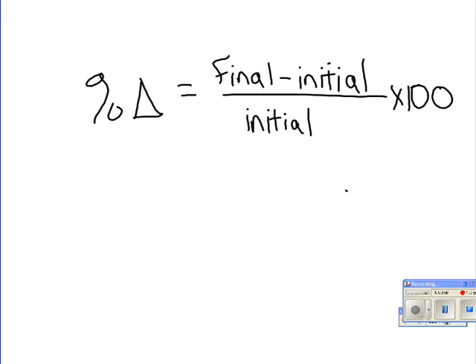So for example, if I look on here for egg number 1, your initial mass was 81.4 grams, and after 10 minutes it was 81.7.